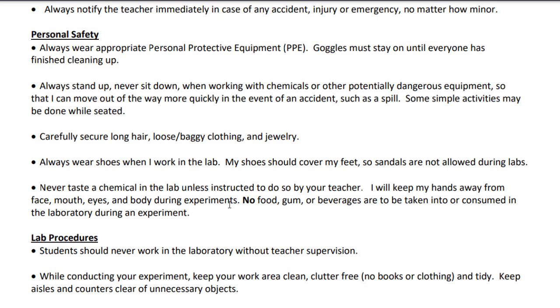And a lot of times we'll try to do chemicals in a different room if there's a different lab available, so you're not eating in the same room. You really don't want to be having open beverages. So you can have a water bottle, not a problem as long as it's sealed up. But we're not eating or chewing during labs or during lessons as well, just to keep everything clean and safe in here so the chemicals don't get into your body.